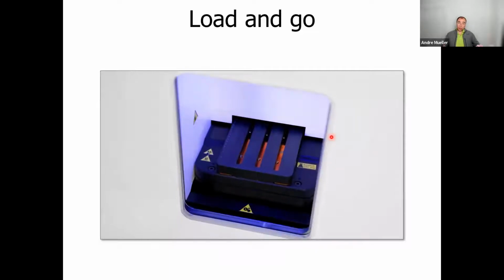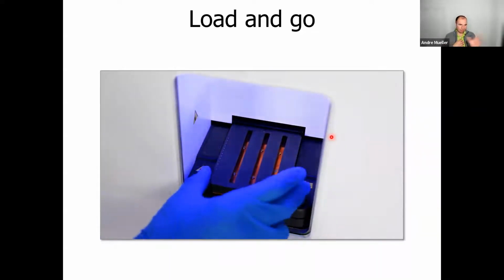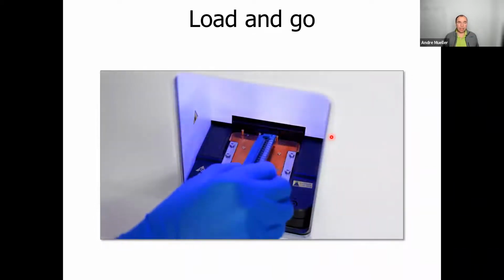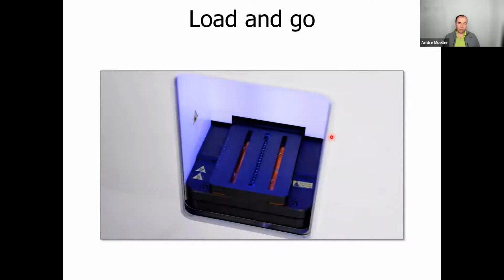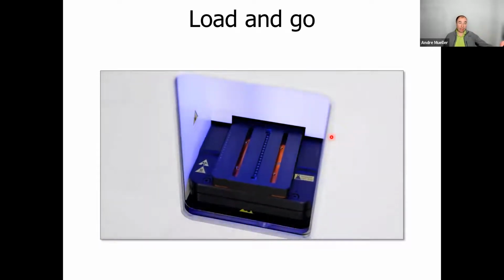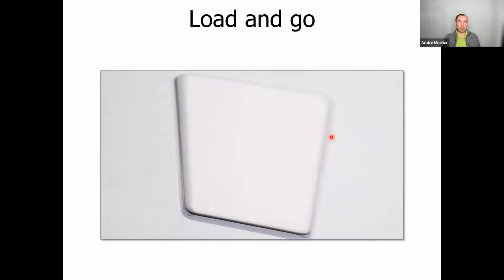Door opens, the tray slides out. You take the lid off the tray. That shows you the Peltier heating element. You place your uni on that Peltier heating element, replace the lid, the tray slides back in, the door closes, and the instrument is ready for the experiment.